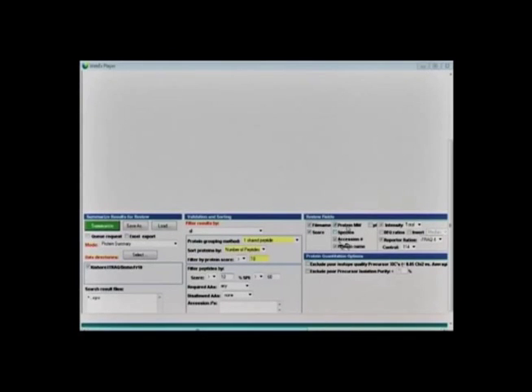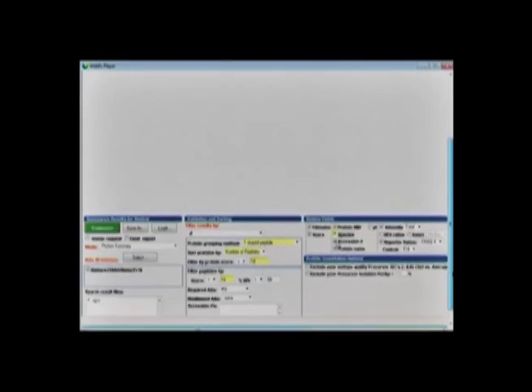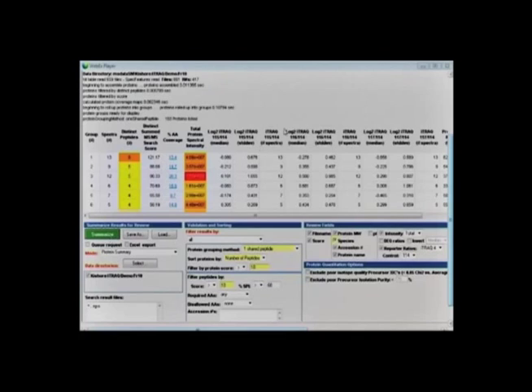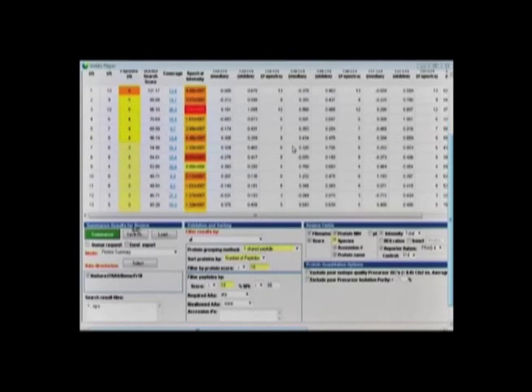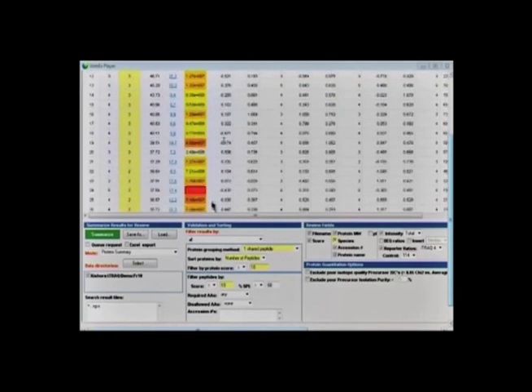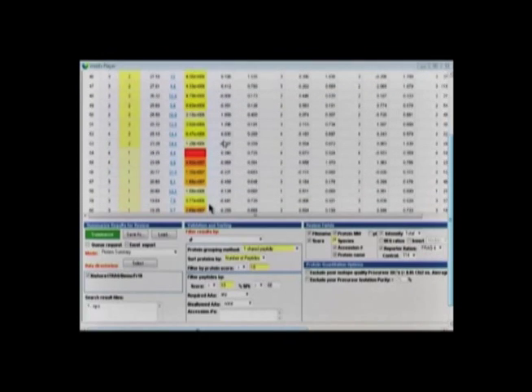In the review field, we can select species, molecular weight, score, peptide information, reporter ion intensity, accession number, and many other parameters. Keep the remaining parameters as default and summarize the results. It will show the number of proteins identified or quantified from the analyzed sample.